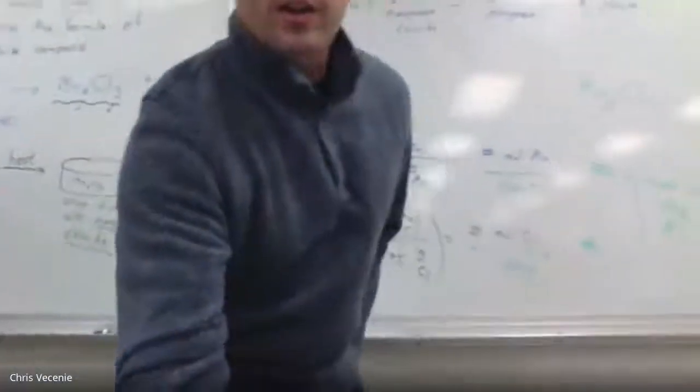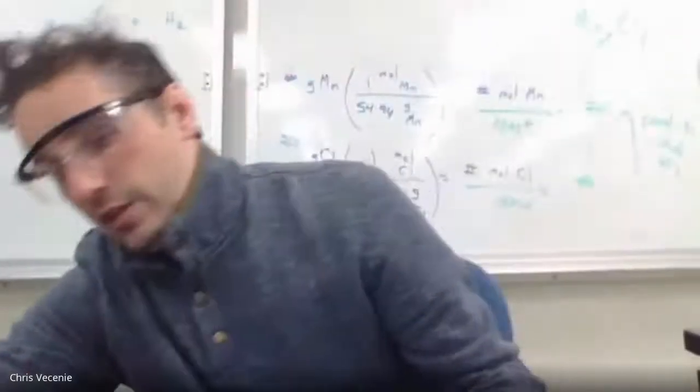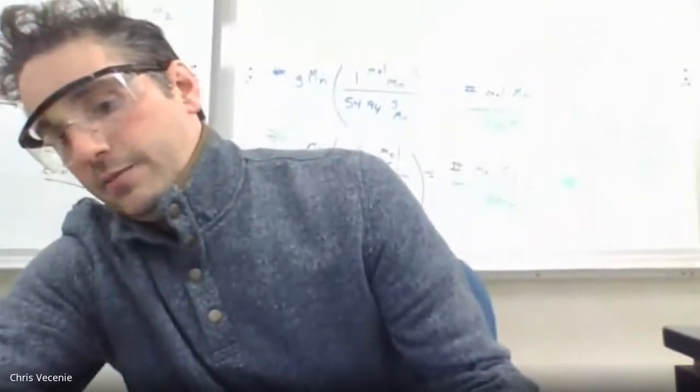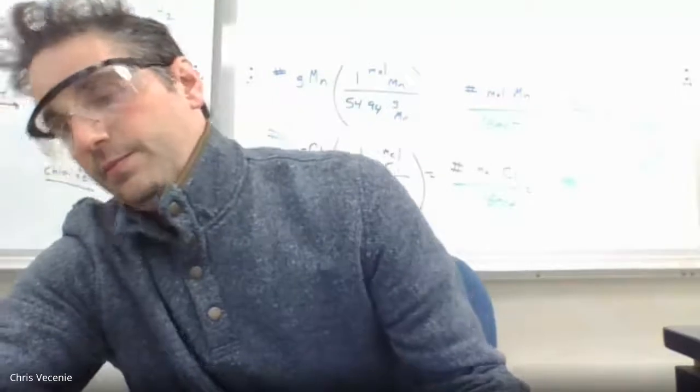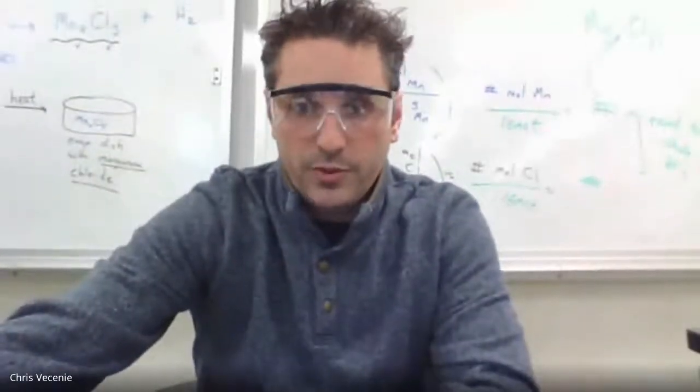I'm going to walk you guys through what you need to be worried about for your lab report and what you guys can be working on right now. All right, so let me go back in here for a second. Okay, and I will share my screen with you now.